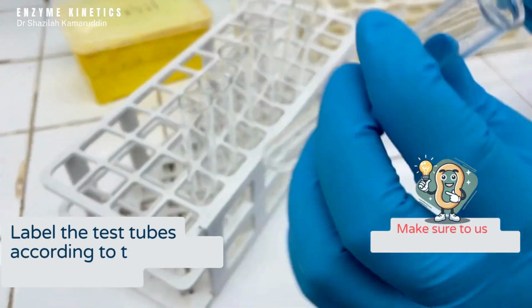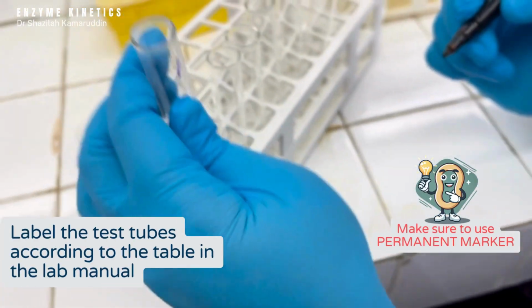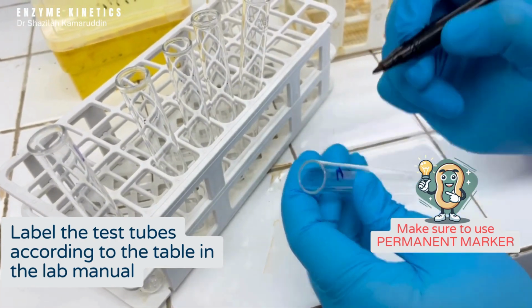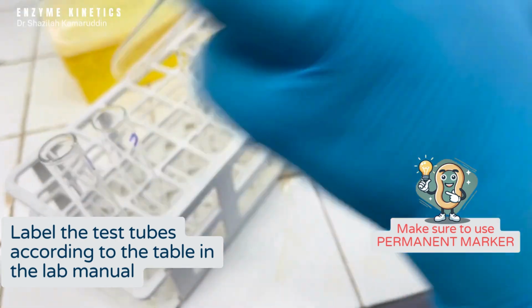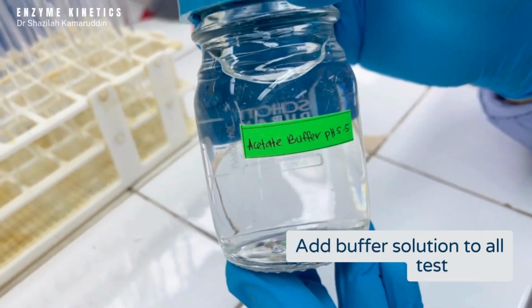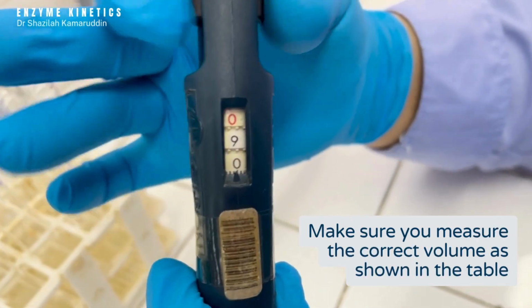Label the test tubes according to the table in the lab manual. Add buffer solution to all test tubes. Make sure you measure the correct volume as shown in the table.